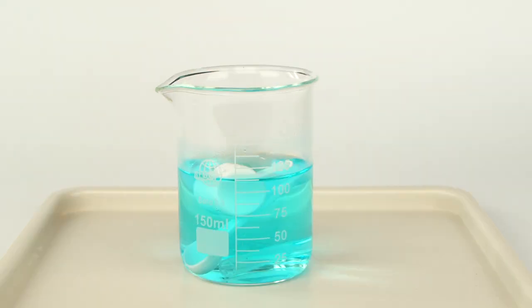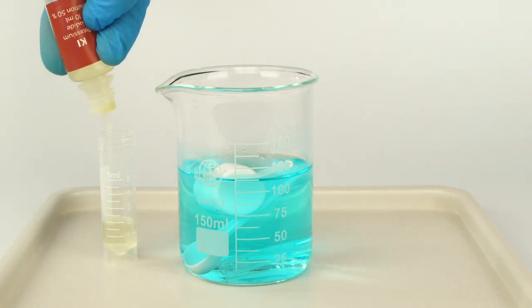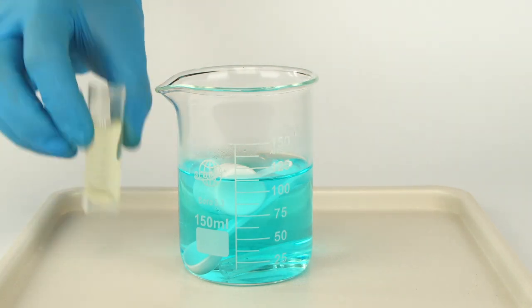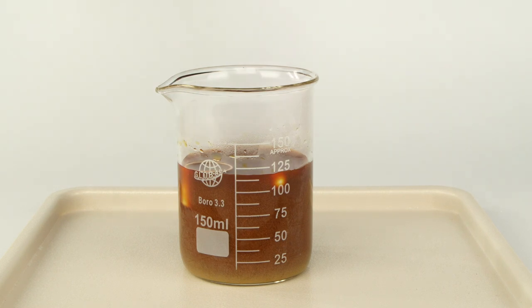Use the graduated cylinder to measure 5 milliliters of potassium iodide solution. Pour the solution into the beaker. Mix 10 seconds using the wooden stick. Cover the beaker with the plastic lid.